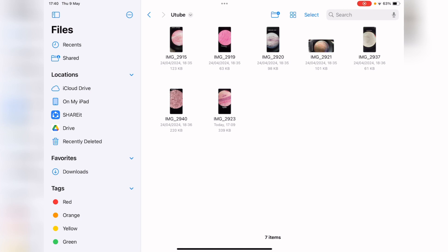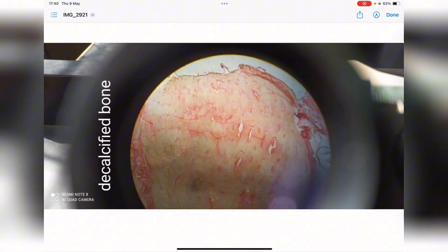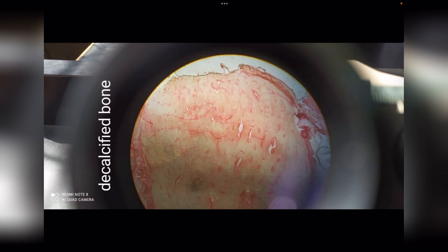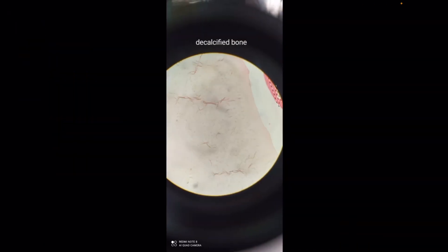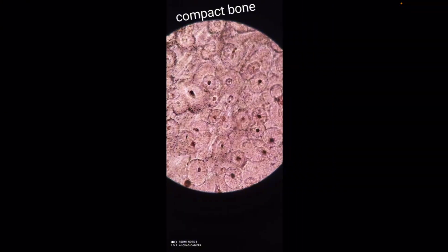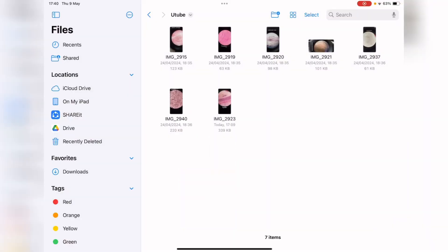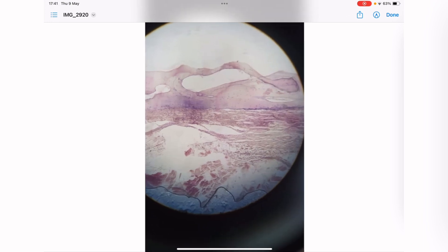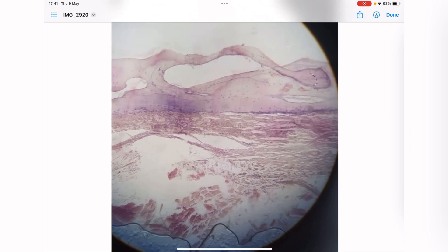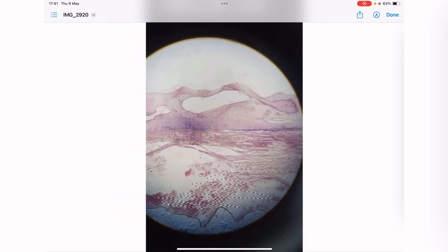Here is another compact bone slide — again, the Haversian system is not visible because it is decalcified. However, this slide shows compact bone where you can see the concentric arrangement of osteocytes in concentric lamella forming the osteon or Haversian system — this is non-decalcified compact bone. Here are trabeculae in trabecular bone with osteocytes arranged inside them, and this is your red bone marrow.